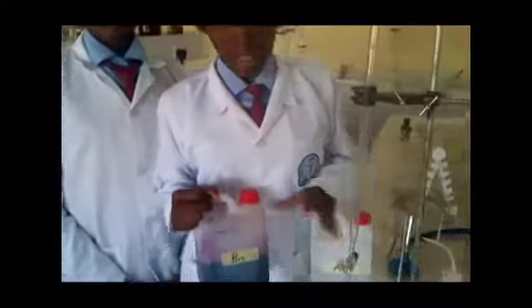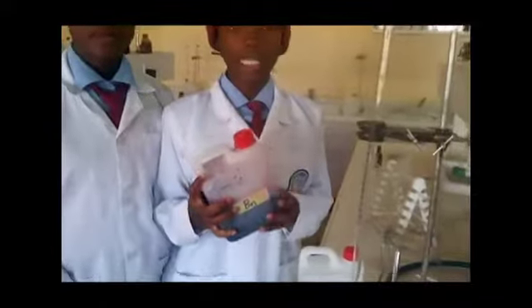And now we are going to start our experiment, our practical. We are going to be making use of our B and our A. Our B here is our potassium permanganate, which serves as the oxidizing agent, and our A here is the oxalic acid, which serves as the reducing agent. And we also have our dilute sulfuric acid. Now I'll hand over to my classmates to continue the practical. Let us start our practical now.